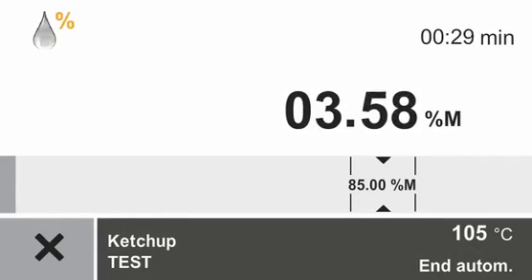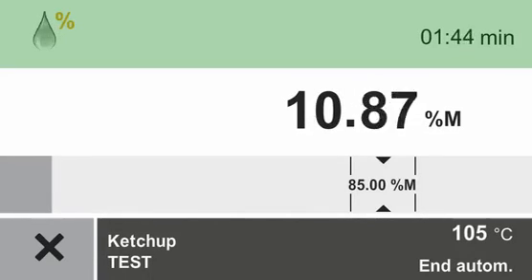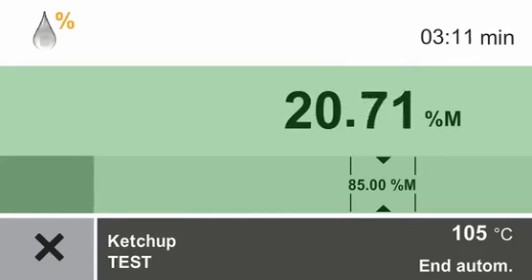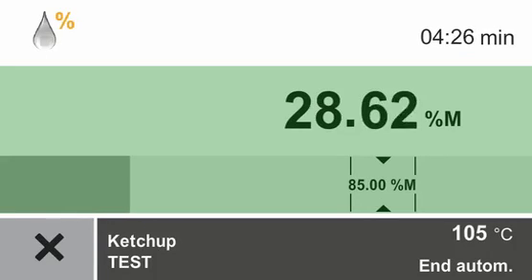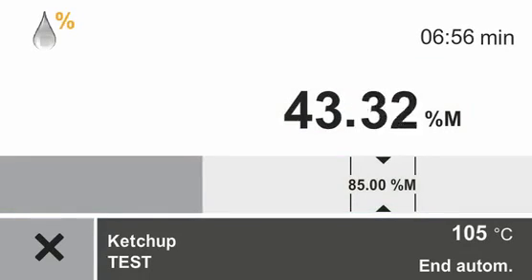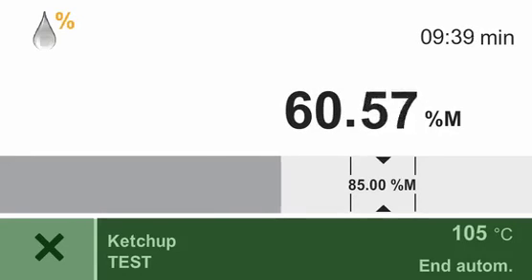You will be able to pursue the course of the moisture determination analysis in the display. In the information bar at the upper section, you will see the actual duration of the measurement. In the central region, the actual measured value, including measuring progress, is displayed. If the target value is known, the measured progress is indicated by a bar, with the target value highlighted and tolerance limits indicated underneath the actual moisture content. If the target value is unknown, the measurement progress is represented by a curve chart. In the function bar at the bottom, you will see information such as the target temperature or the shutdown criteria.